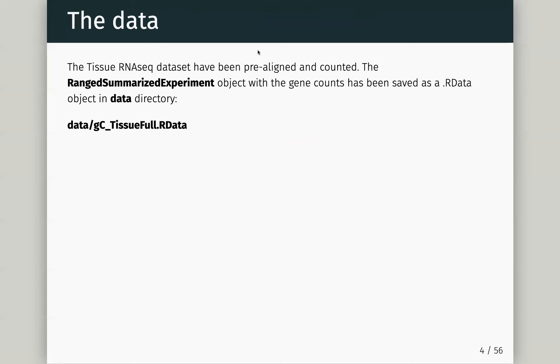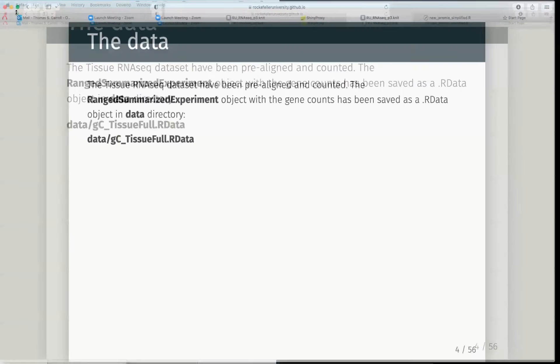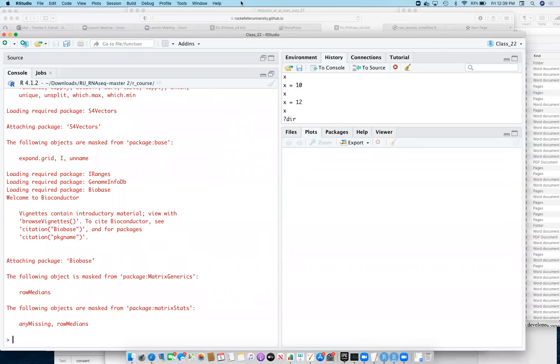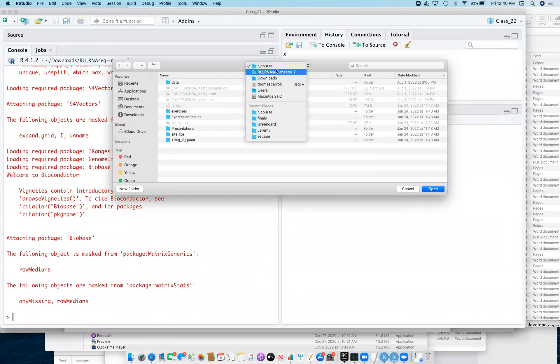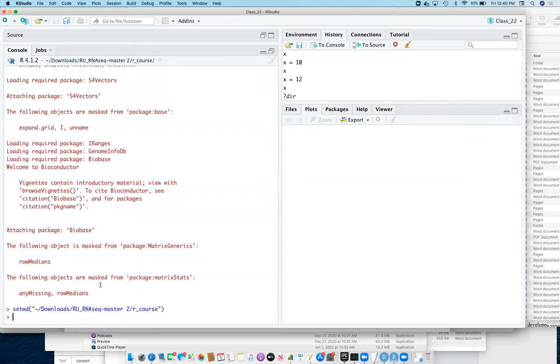I aligned it the same way, counted it the same way, and this produced a RangedSummarizedExperiment object which had our counts in genes, and then I've saved that as an R data file. So you can load this now — often this is what you'll do. You'll get your data, save it as an intermediate file. I've saved it in the data directory: gctissue_full.RData. To follow along, do Session > Set Working Directory to wherever you've downloaded the material for this class.